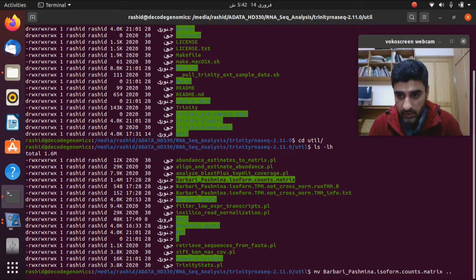There is a folder named analysis, I think, autocomplete. Okay, so we move it another way, so it would not be confusing.